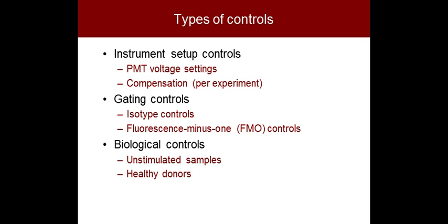It is something that you should check even after it's calculated for you, by simply looking at your fully stained samples and making sure that the populations in each color combination that you can devise are looking appropriate, so that things are orthogonal to the axes when they should be, and there aren't some kind of diagonal streaks coming up that you would not expect. So that's something you should check, and that's all I'm really going to say about instrument setup.